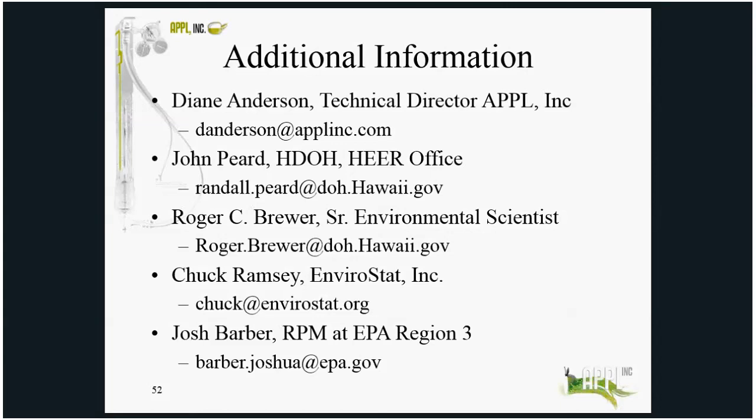Well, we typically don't grind Hawaii samples, so probably a third of our samples are ground. The common contaminants we're asked to do are probably PAHs, metals, and dioxins most often. I guess for grinding, lead is a contaminant of concern. That's high on the list for grinding samples, or maybe metals in general. Yes, lead, especially if there's any chance that there's pellets there, lead must be ground.